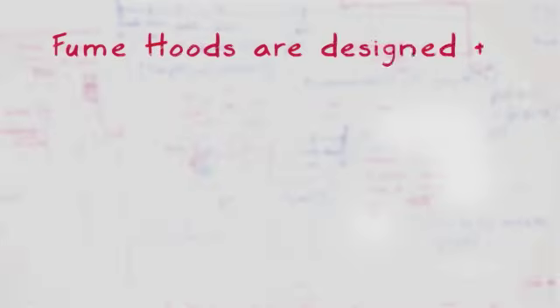Thanks for joining us. We are going to do a dissection in today's session of our video series of laboratory safety. Well, not exactly, but we are going to look closely at the purpose, parts, and correct use of fume hoods as we review fume hood basics.